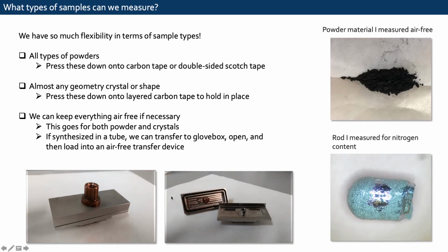This is an example of some powder I measured air-free and a crystal rod that I measured as well. So it's really flexible.